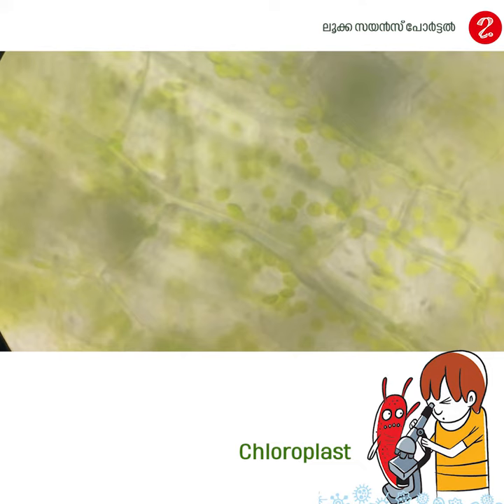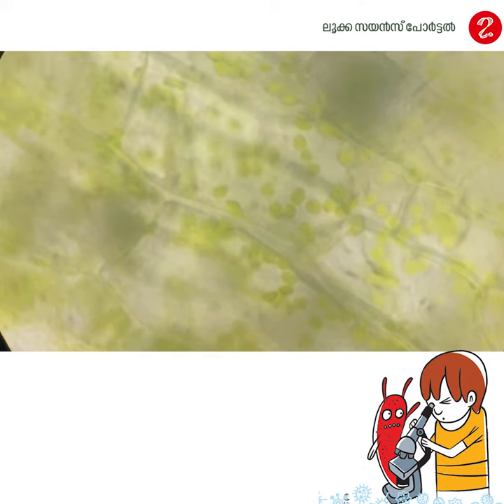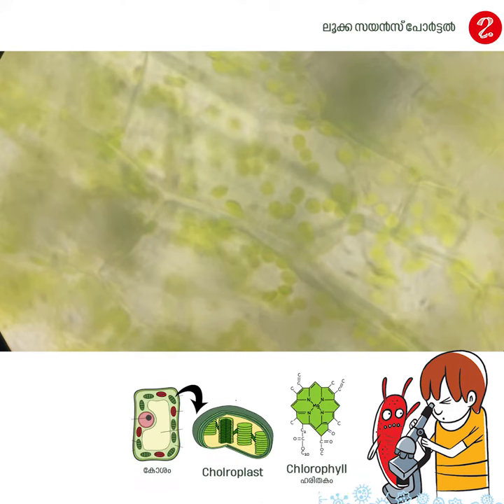Chloroplast is responsible for photosynthesis. Chlorophyll is present here. At higher power, we can see the chlorophyll more clearly.